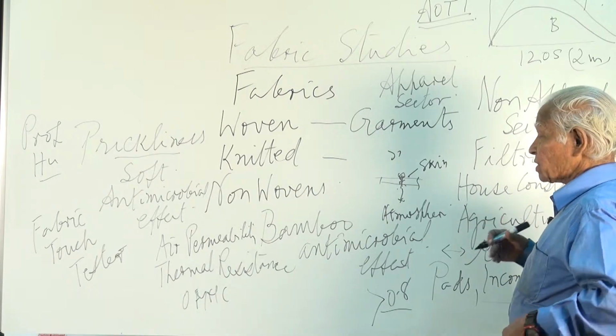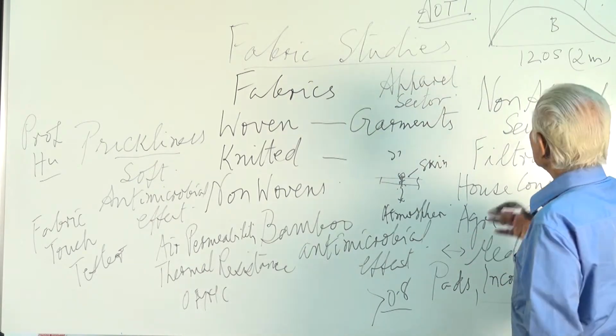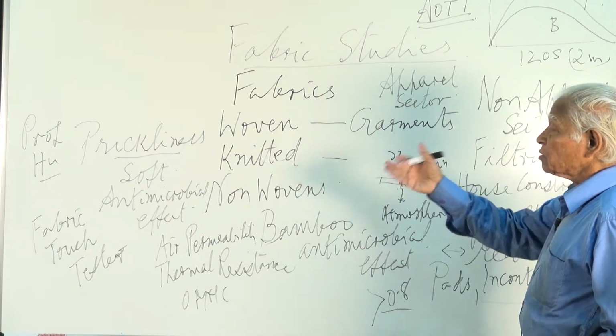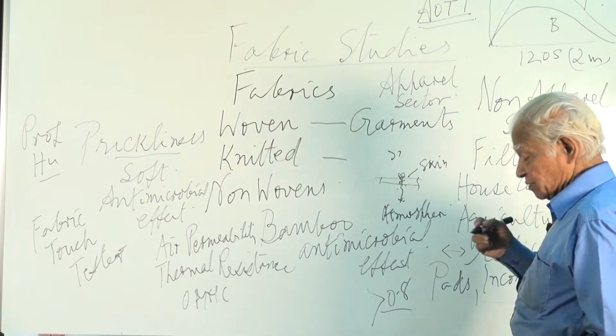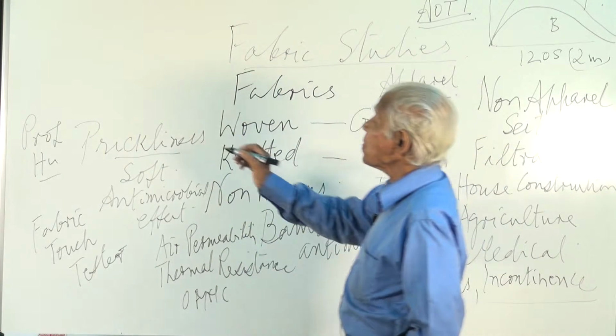So today our knowledge about these characteristics, comfort characteristics in particular, has considerably improved because of the introduction of this overall moisture management control tester. It can be used very usefully for assessing the performance of sportswear.